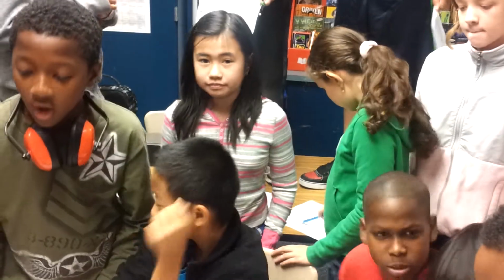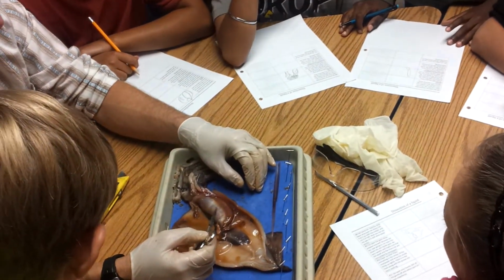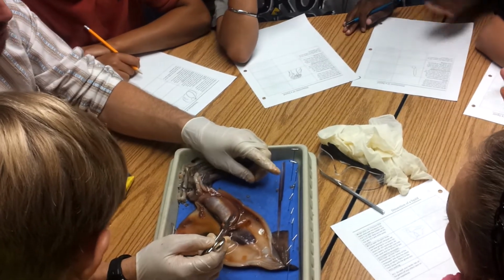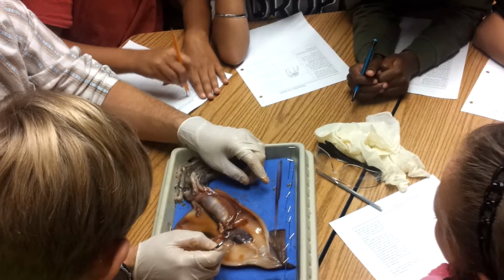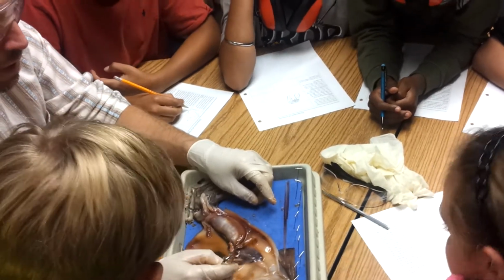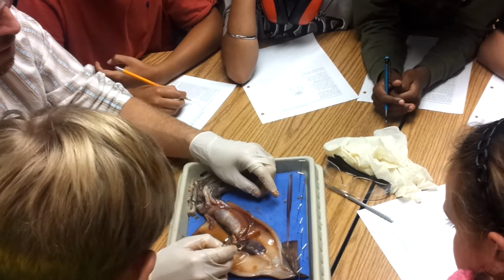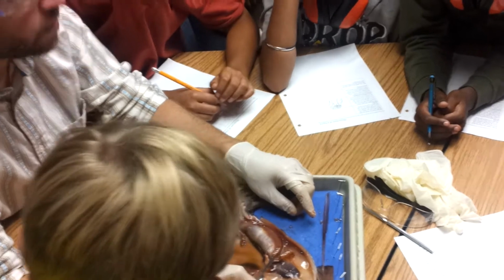Now, this part in the middle here is its stomach. Can we open it up and see what it ate? I don't want to. Leftovers. Come on, do it. This part up here means it's a boy. I knew it. Very nice. If there's a big thing up here, this little floppy thing, that's the boy, and if it's further down here, that's a girl.